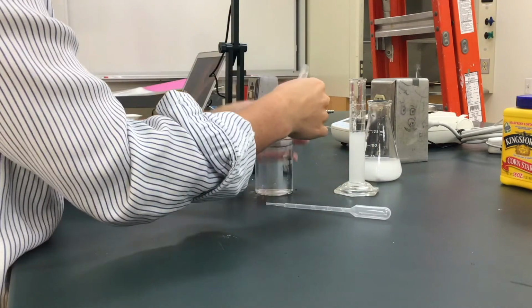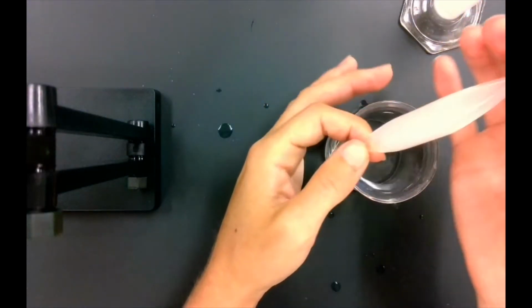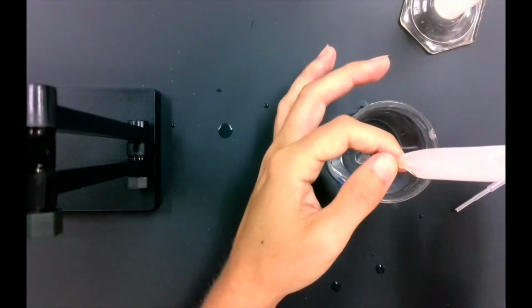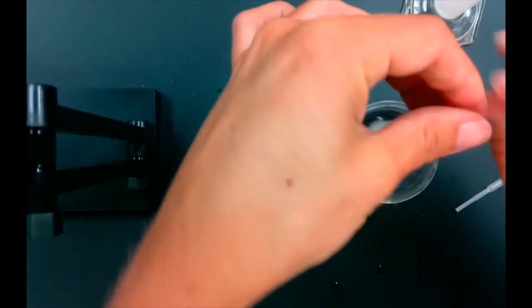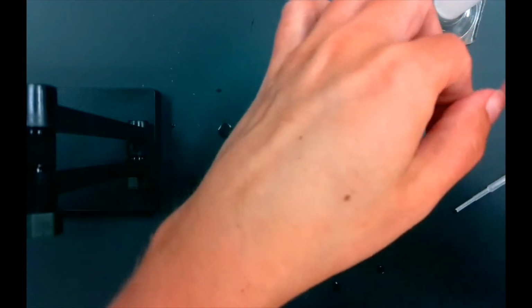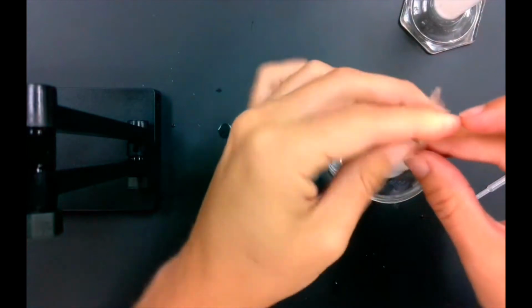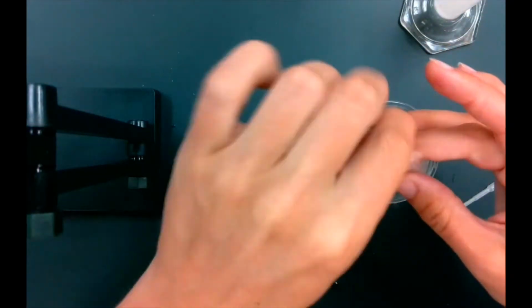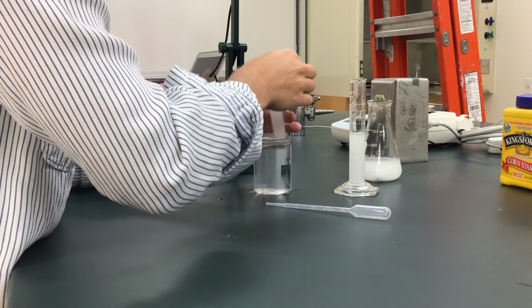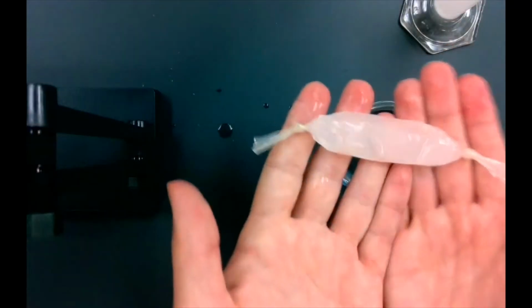I'm going to stop there because I actually don't want this tubing to get too full, but as you can see, I've been able to pipette about 10 milliliters into the bag, and I'm going to tie off the other end. I want to make sure that both ends are tight. Great. Perfect. So I'm going to give it a rinse just to make sure. There, and that's what we have.